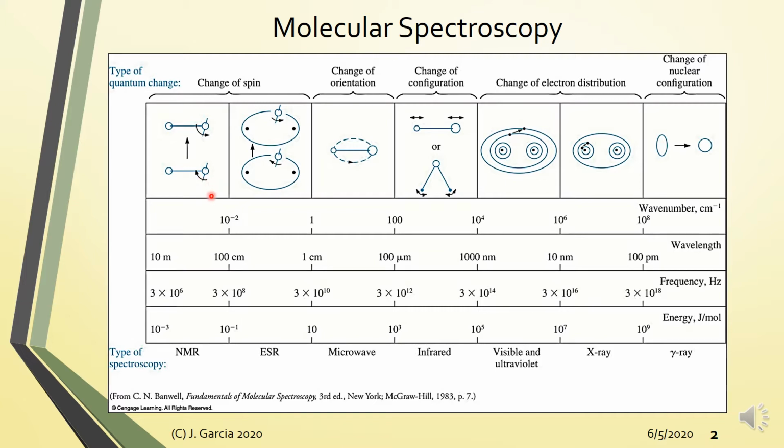Okay. ESR, this is electron spin resonance spectroscopy. Kadalasan sa inorganic chemistry nag-uusapan ito. This is a powerful technique for studying intermediates ng chemical reaction, especially yung nature ng mga radicals or yung mga transition states.